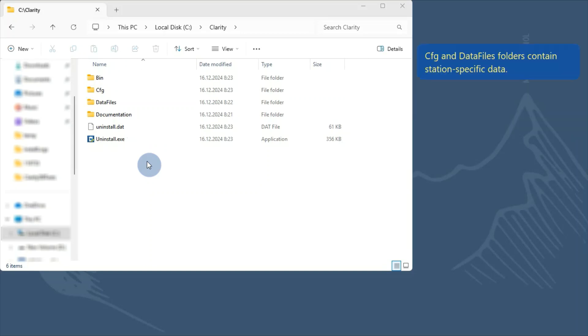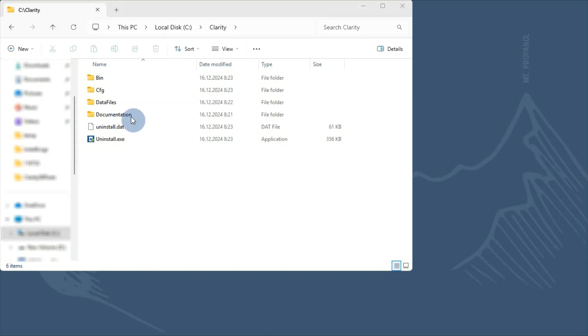The CFG and data files folders contain all the station specific data, so you can back up both of these folders and use them if needed. Now, let's take a closer look at the configuration folder.